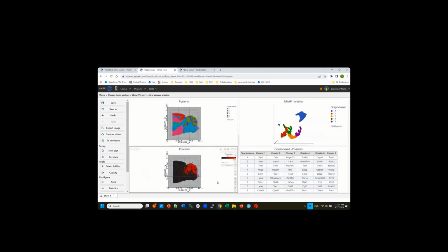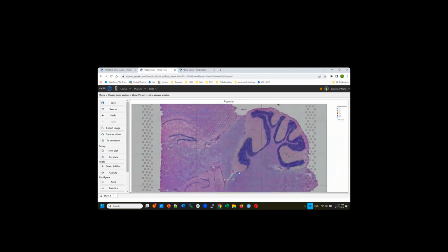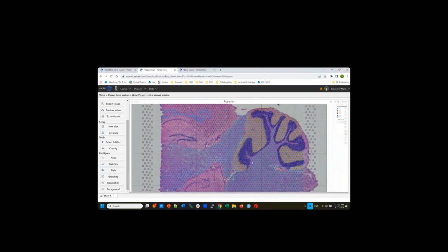Another nice thing is if you want to select the cells, you can zoom in and make the dot a little bit bigger. Suppose you want to select some cells over here. We have a new selection called the paint mode, and it's only in this new version. I'm not sure whether the NIH service has been updated.